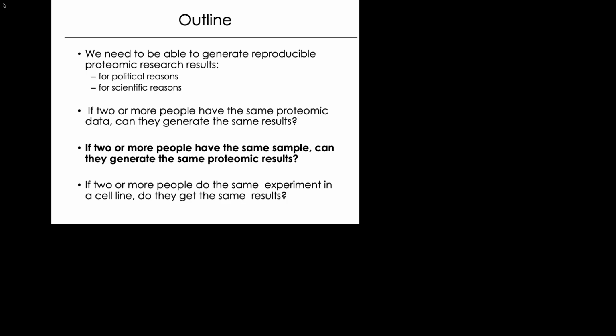I cited on Wednesday a study, which is a very simple study, where 20 proteins that were equimolar could not be identified consistently across laboratories. So there's been enormous progress in the field through the tools, and I would say for this question we can give a positive answer.